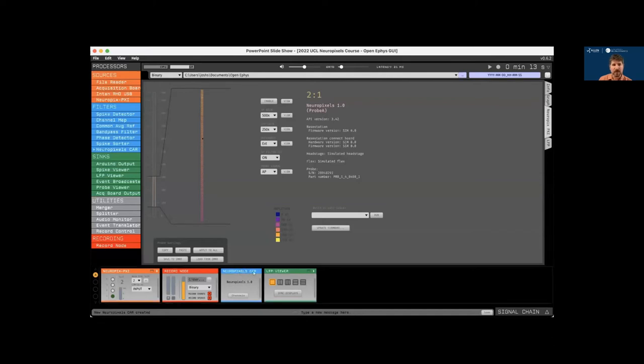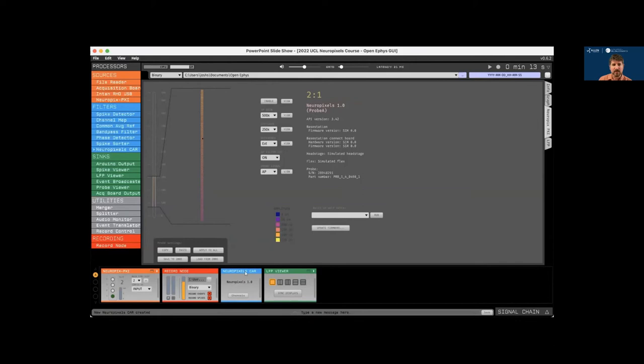In most cases though, we recommend not placing any filters between a source node and a record node. And this way, the raw data coming out of the Neuropixels plugin will be written directly by the record node. And then the common average reference will only affect the visualization. If you want, you can always insert additional record nodes at other points in the signal chain.